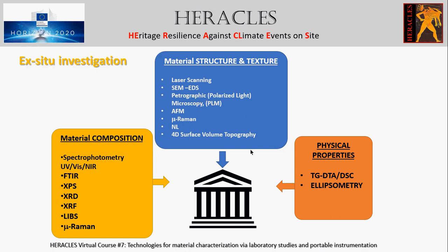However, it can give definitive information on the crystalline phases present in the sample, qualitatively and quantitatively. Moreover, it is fundamental for the identification of mineralogical phases in inorganic materials. These two techniques, X-ray fluorescence and X-ray diffraction, will be the object of part 2 of this course.